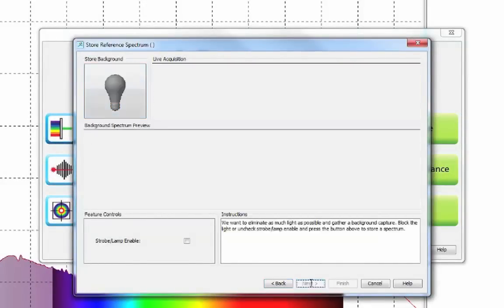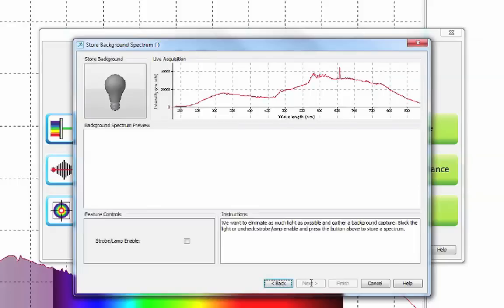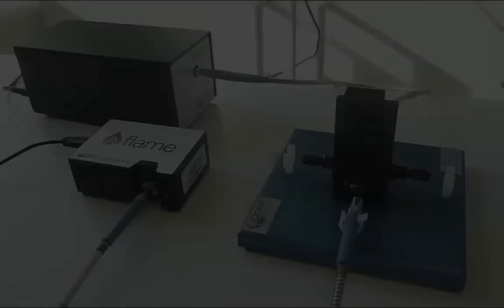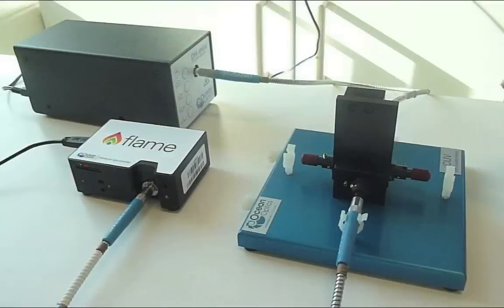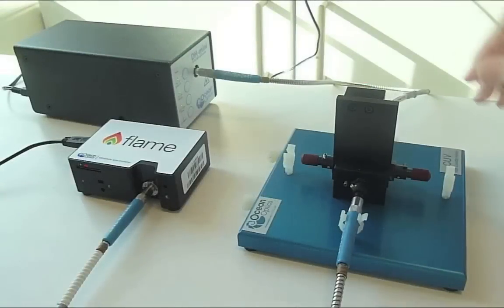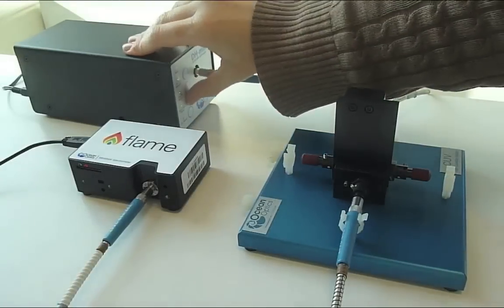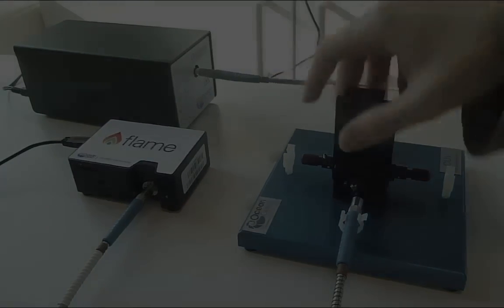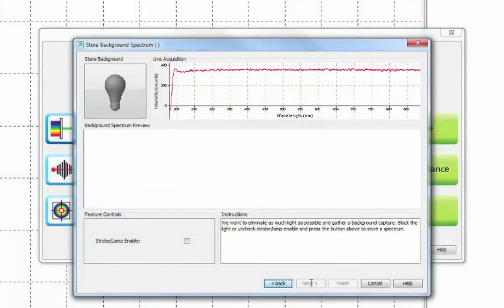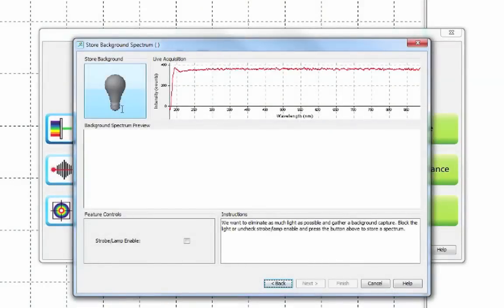Next you will be asked to take a dark. This requires you to stop any light from getting to the spectrometer. The easiest way to do this is by using the shutter on your light source. Click the grey bulb in order to take your dark.